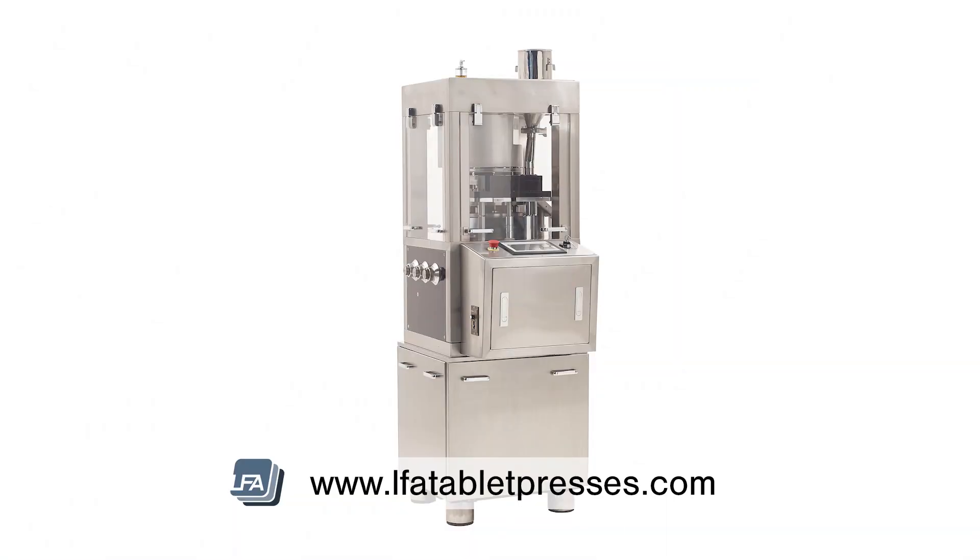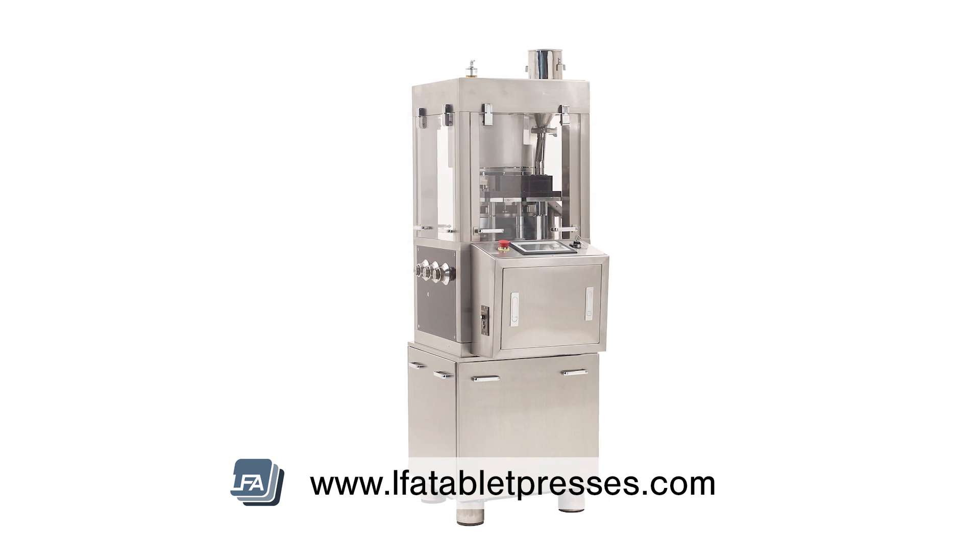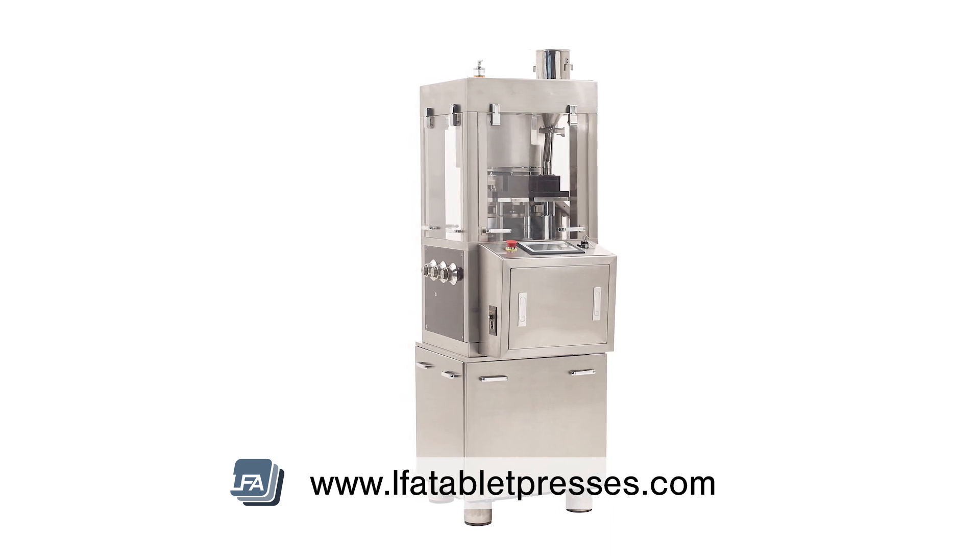Welcome to LFA's video on calibrating your RTP-10i force feeder. You may need to calibrate your force feeder after cleaning or if too much formulation is flowing onto the die table.